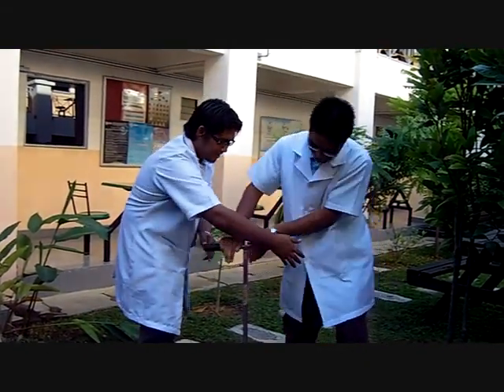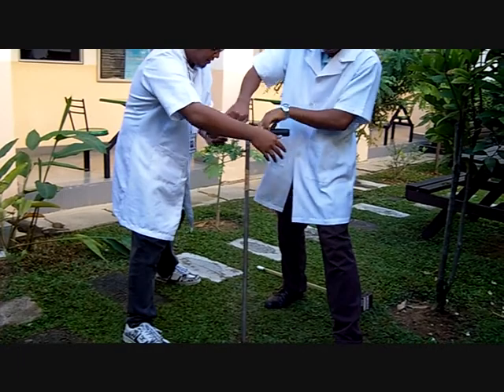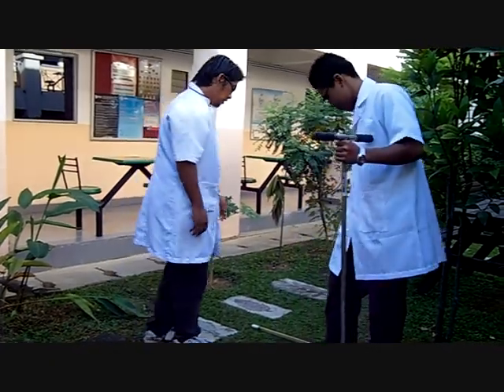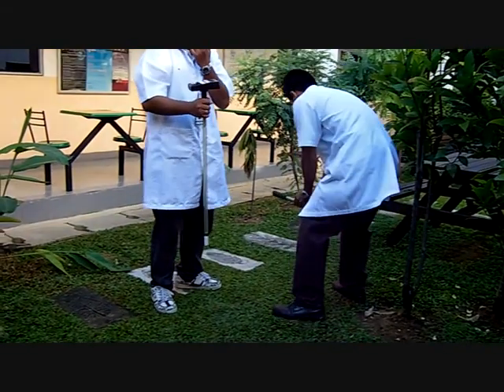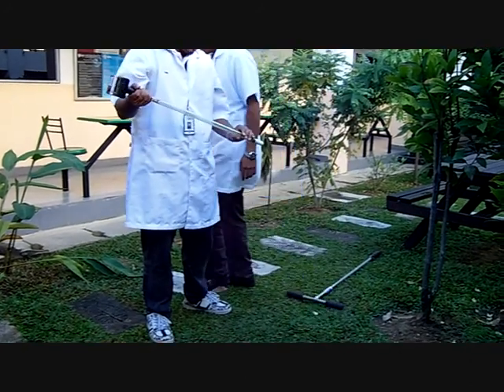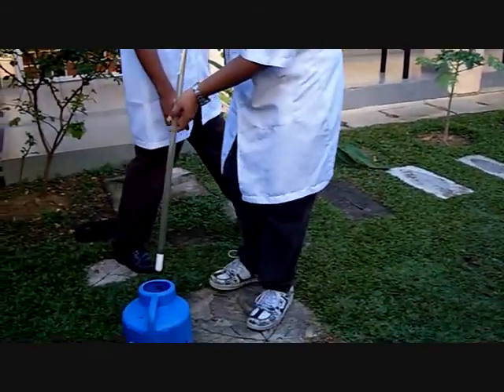Now we are ready to dip the tensiometer into the hole. But before that, we must make sure that the tensiometer was soaked with water about 8 hours before using it.